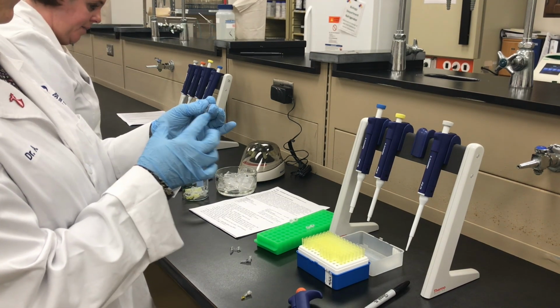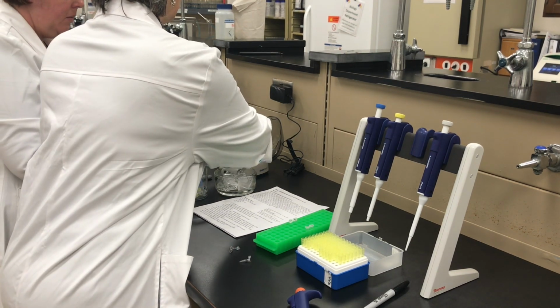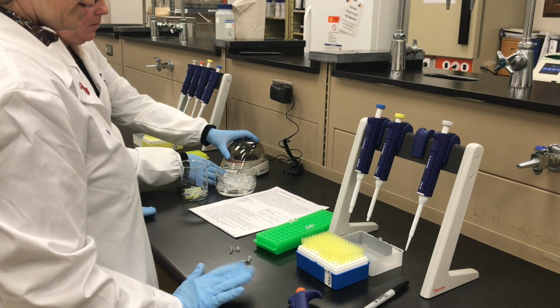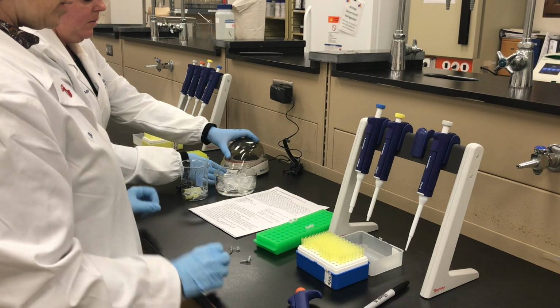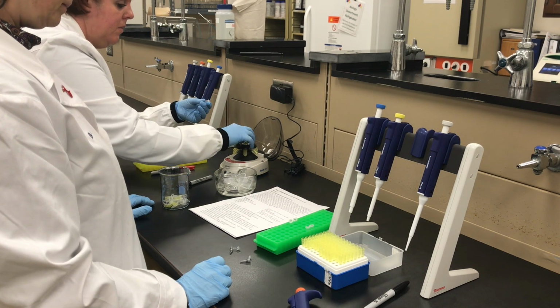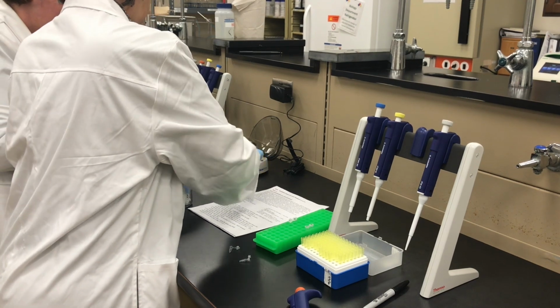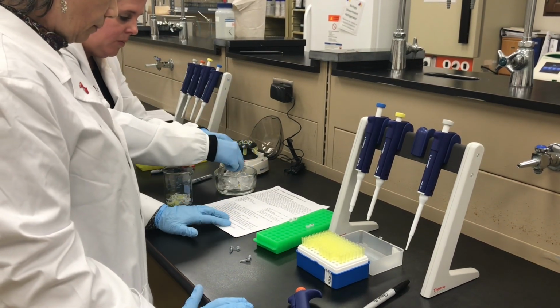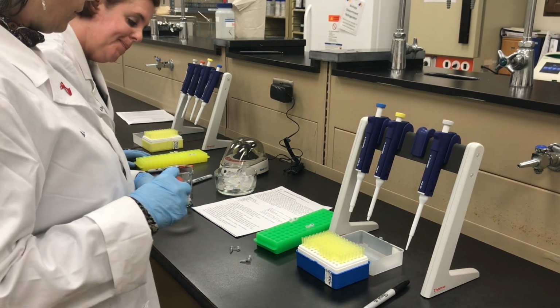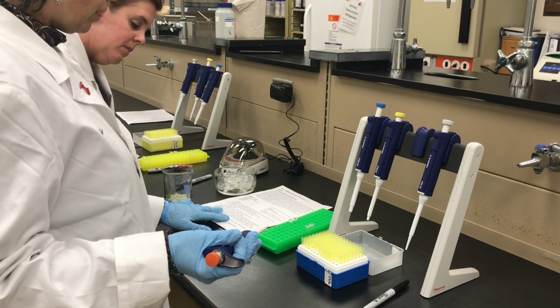We'll spin all 4 of our tubes together. Literally 2 seconds does the trick. This is to make sure all the liquid's at the bottom of the tube. Now, we're going to pop them on ice. Okay. Alrighty. And proceed to step 5. Now we are removing 19 microliters from tube 1 into tube 2.